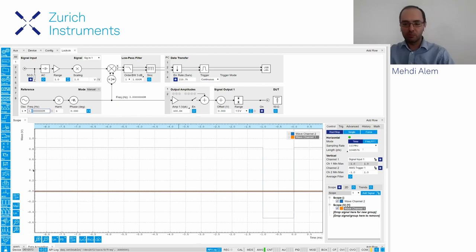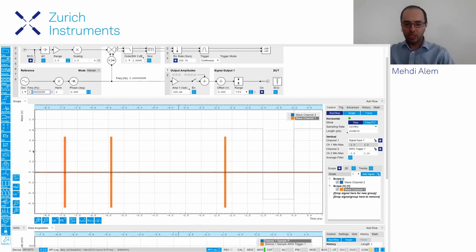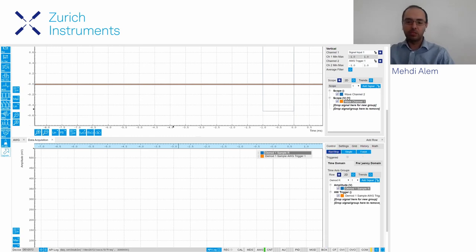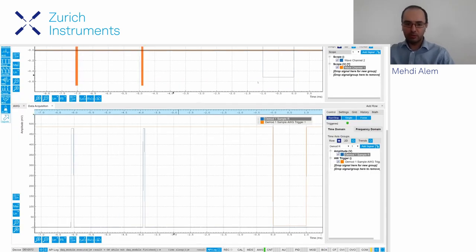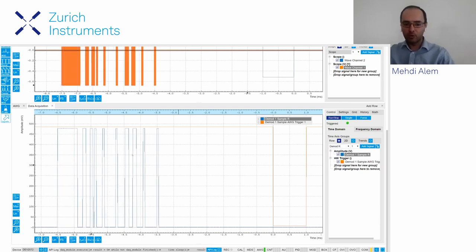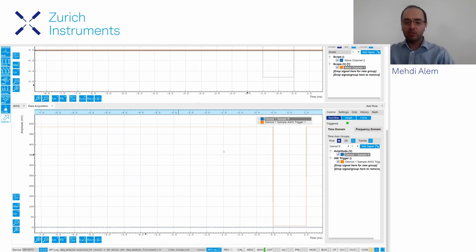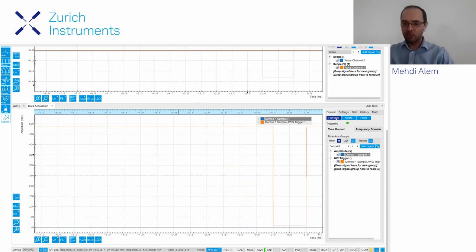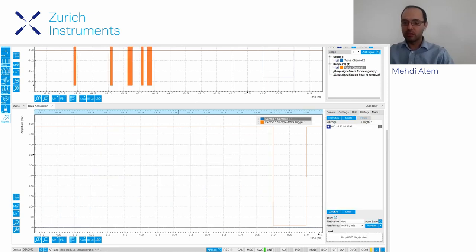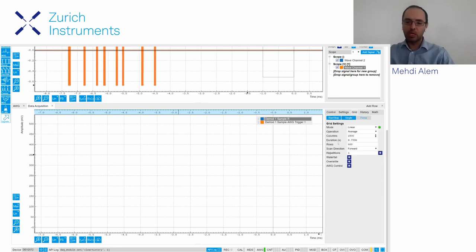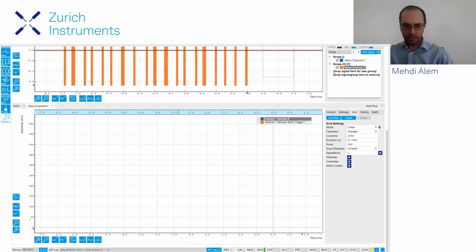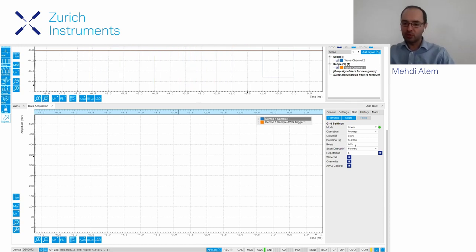Here in the data acquisition module we first look at the demodulated signal. If I run the data acquisition, you'll see the trigger — the same as above — and now this is the demodulated signal, or the envelope of your signal. Now that you have the trigger, you'd like to stack these lines on top of each other. In the grid section we have a number of columns and rows determining how many points per line — in this case 1500 points per scan and 600 lines.